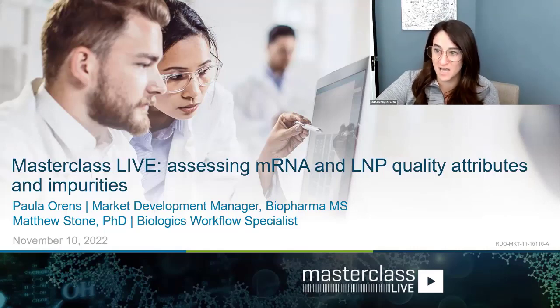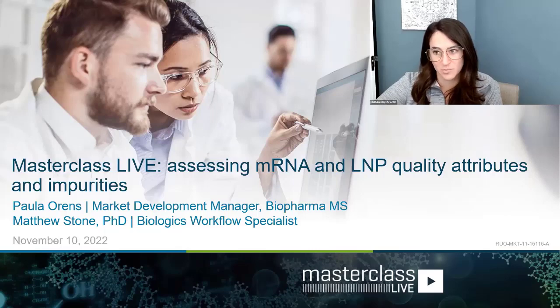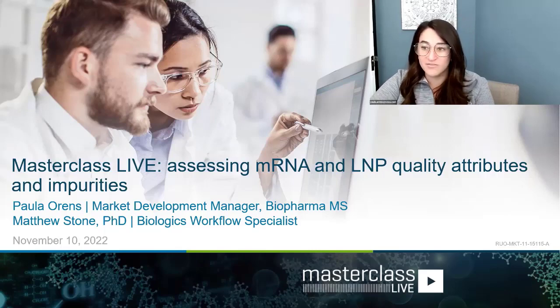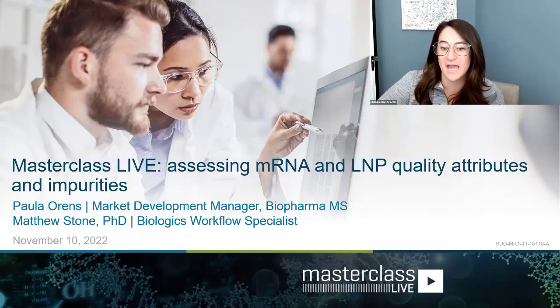We have a lot to talk about, as I mentioned. We're going to provide a bit of an overview at the start of why the analysis that we will be doing today is important. Then we're going to go into those details. So you will see firsthand how to process or characterize the 5' cap of mRNA. Then we'll break again for questions. And our last section will be on identifying LNP impurities and oxidative sites.